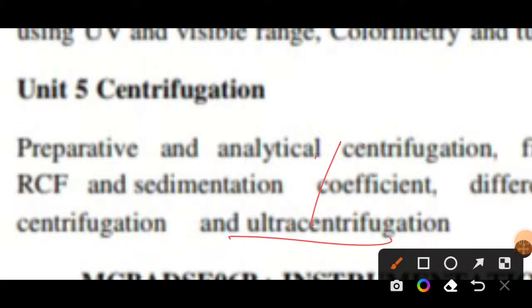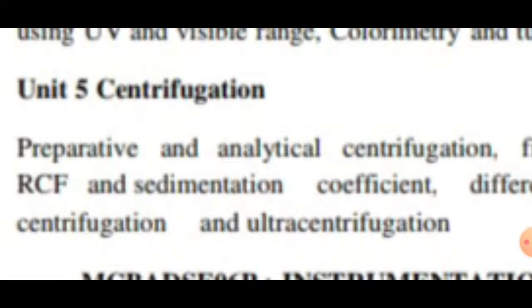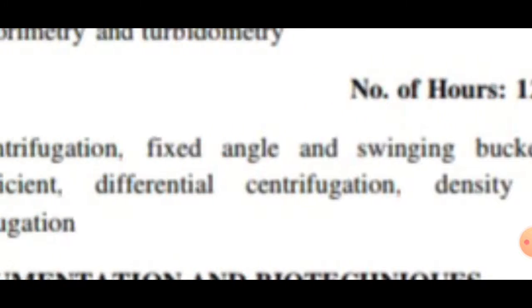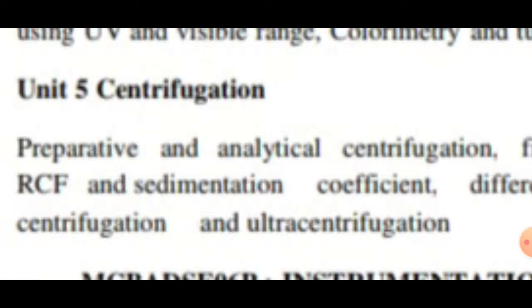Okay, although among those we have already discussed some topics in detail earlier, today we are going to take two new topics, that is fixed angle and swinging bucket rotor. Along with that, we are going to revise the chapter also. So let's start.